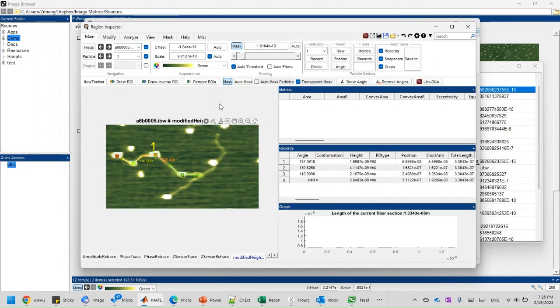And yes, we have to redo the mask for now. If you wonder why I cannot click this one, it's because right now the mask is only localized to these 3 particles. That's what we did with our script, right? It tried to crop the mask into the 3 individual components, right?